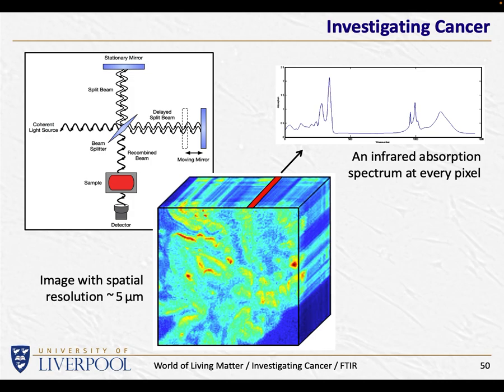So you can either think of it as a pack of cards where each playing card is an image of the tissue with a different infrared wavelength, and if it looks different at different wavelengths, we're looking at different absorption of different wavelengths. Or you think of it as an image where each pixel in the image is actually an entire spectrum, showing us that as a function of wavelength, I know you can't see the scale here, this particular wavelength absorbs a lot, and then it doesn't absorb much, and then this wavelength absorbs a lot and doesn't at the next wavelength, for instance.